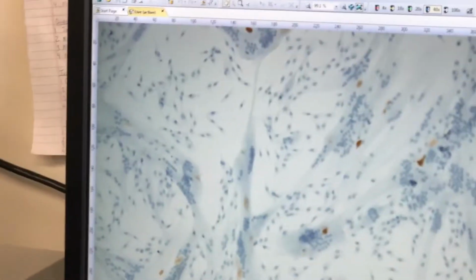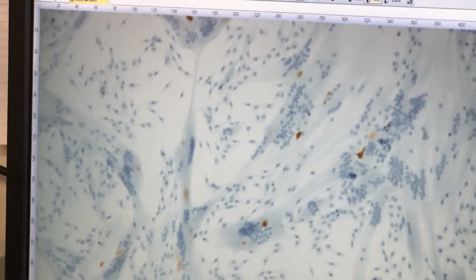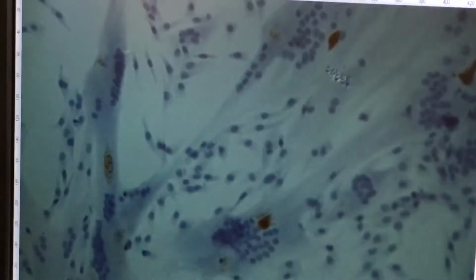So it isn't protein or something else. As you see, we were able to detect this signal in both nuclei and cytoplasm. Here, it's around 4 or 5 days after differentiation, and you can see the brown signal around the nuclei in differentiated tubes. The brown is showing where the DUX4 is.